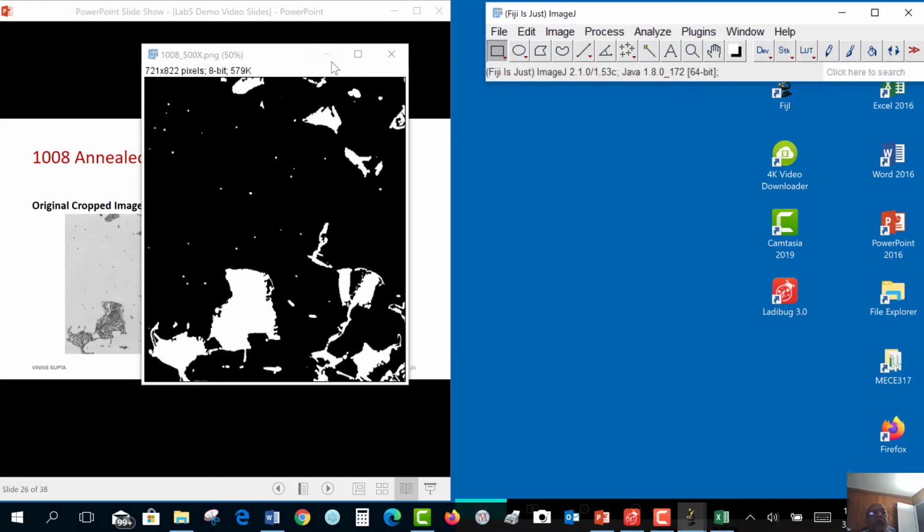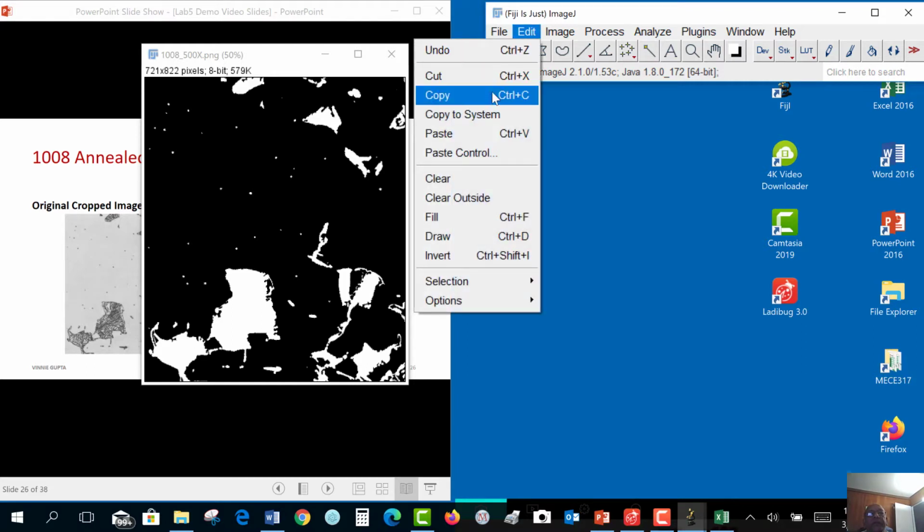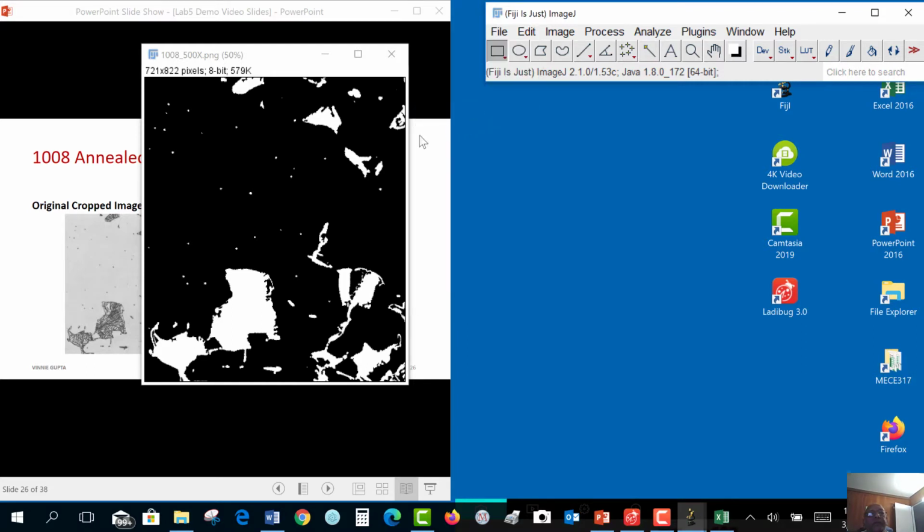So I am going to copy this image and put it in my Word file.